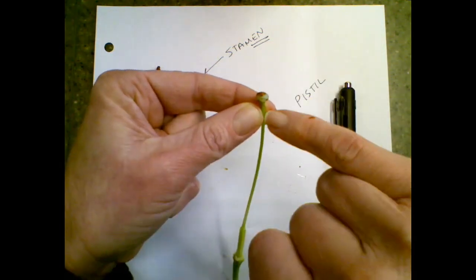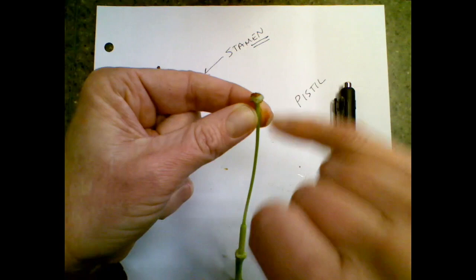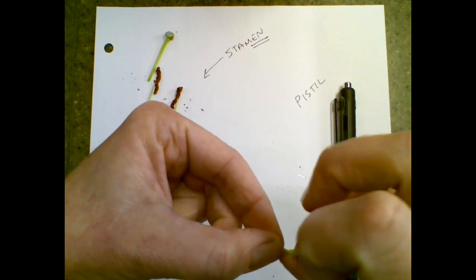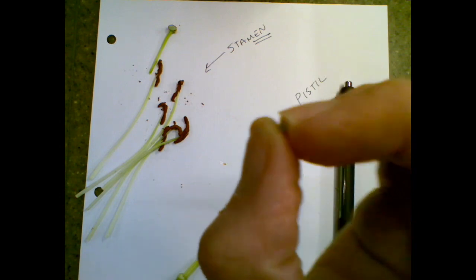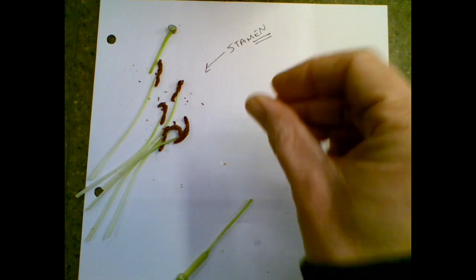So, like if I ever had a band, maybe I would call it stigma style, or sticky stigma style. And sometimes if you look inside of it, you can actually see that it's a tube, and that there's a hole in there. So when you guys get your flower, maybe you can try to see if you can see that this is a hole. There's a hole.